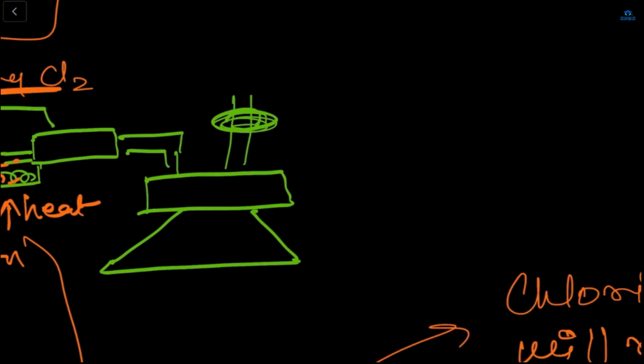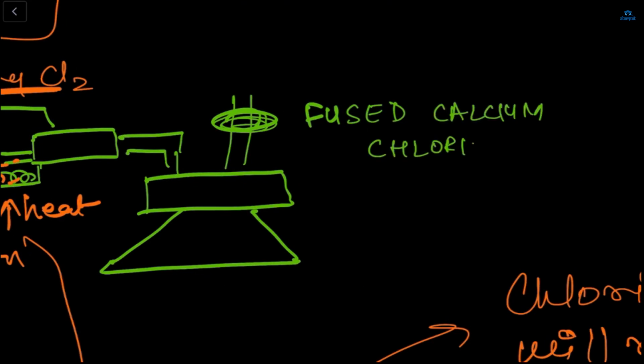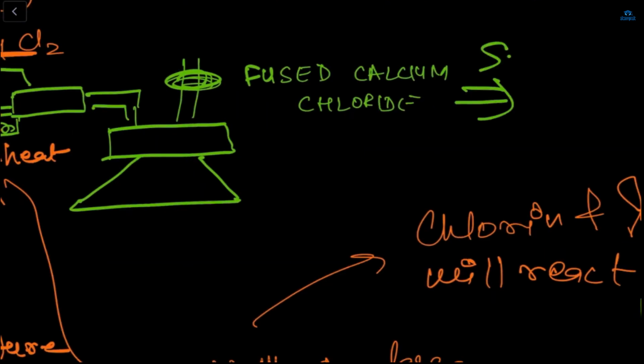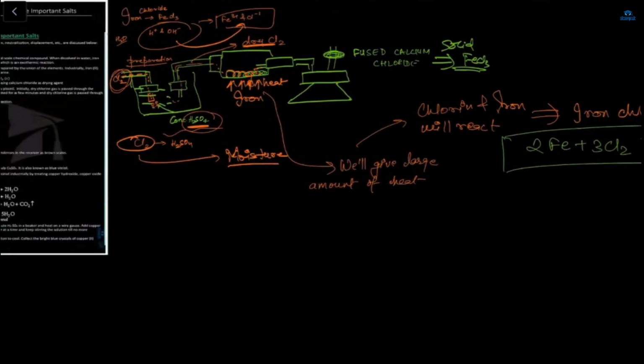So here in one tube, we put fused calcium chloride, so that the moisture which is present in that FeCl3, it will absorb all the moisture and we will get a solid FeCl3.